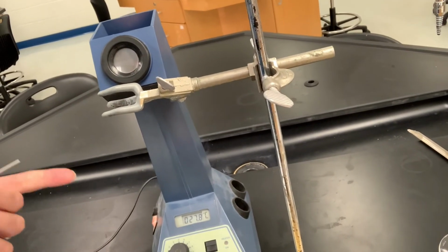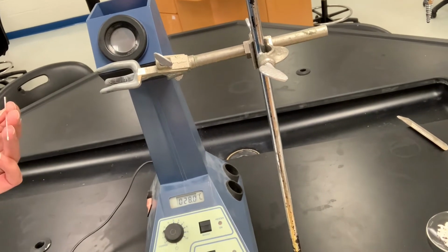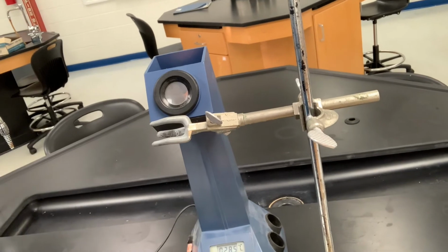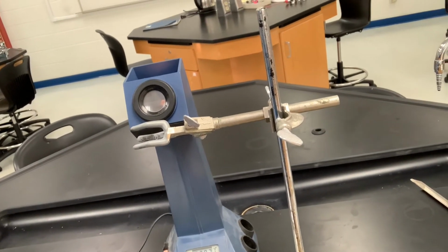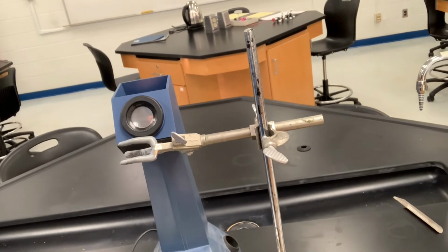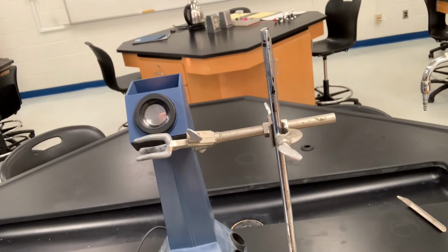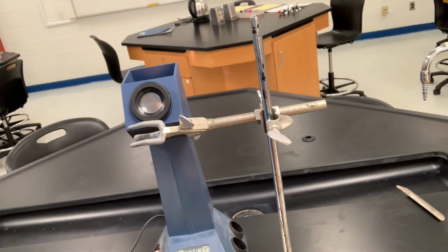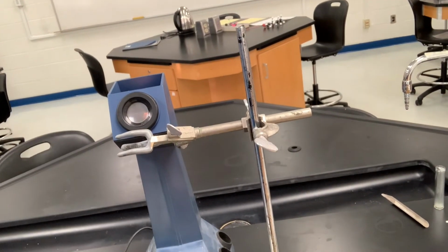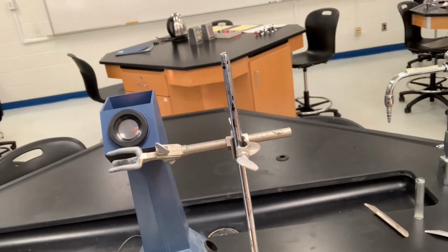You wanna use a melting point from one literature source. Many melting point literature references might have different numbers, so you wanna use one number. If it's 148 to 149, use that. If it's 150 to 151, use that, okay? Maybe in your comment section, mention which reference you're using for the melting point. So I'll come back when this is ready and we'll take a melting point.